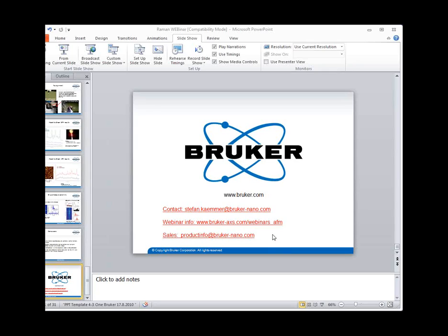Would it be easier to integrate the Raman technique with the icon as the large scanning stage was already fitted? I'm not 100% sure what you mean by that. Can you combine the Dimension Icon with Raman? Yes, there's a co-localized setup that we have. There are actually 2 pictures of that setup in the presentation that I showed you.